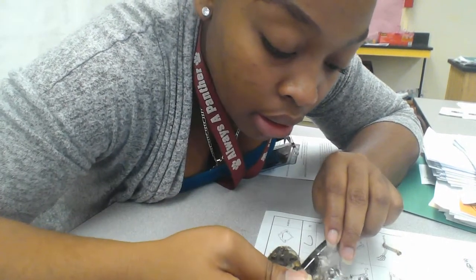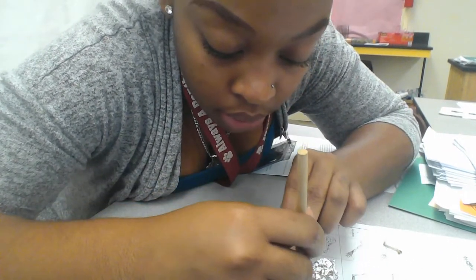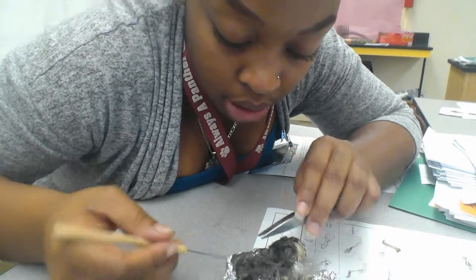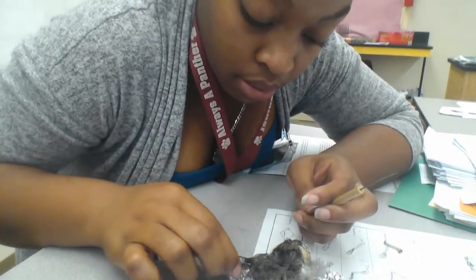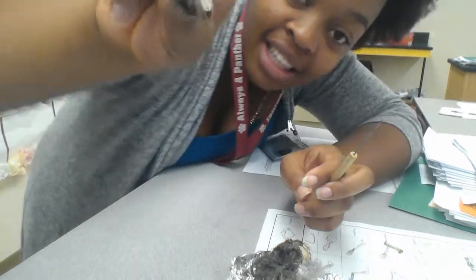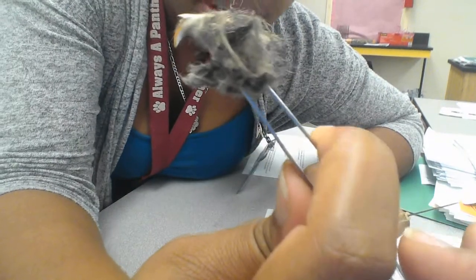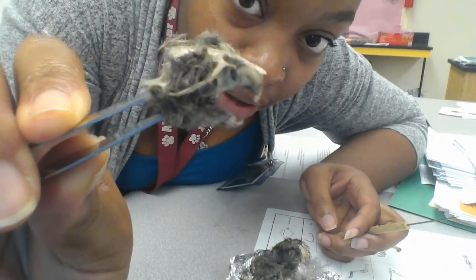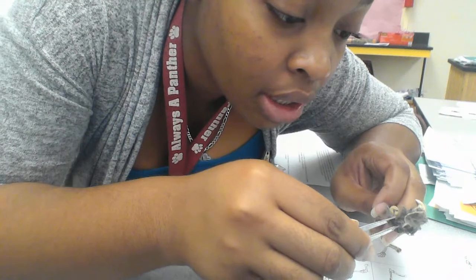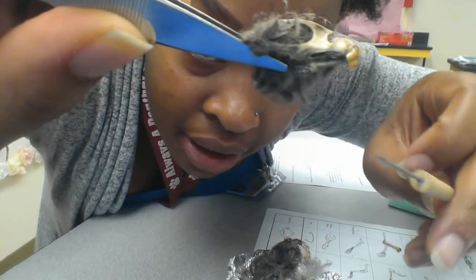Oh, it might be a rodent skull because I can see the teeth and they're extremely yellow. I'm not gonna lie, I definitely broke off a decent piece of the skull. But here it is, look. Ew, look at the teeth. Yeah, so that's a skull. I didn't want to try to get all that fur out because it was gonna pretty much break that thing apart. You can literally see the teeth. I'm gonna try to take away some of this fur. So you see it? The bottom teeth right there?